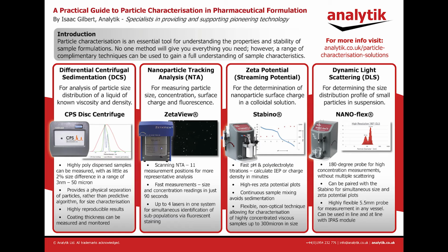Particle characterization is an essential tool for understanding the properties and stability of sample formulations. With a wide range of techniques available to measure and collect a vast amount of data, it can be difficult to understand which is most suitable for a particular application. No one method will give you everything you need. However, a range of complementary techniques can be used to gain a full understanding of sample characteristics.